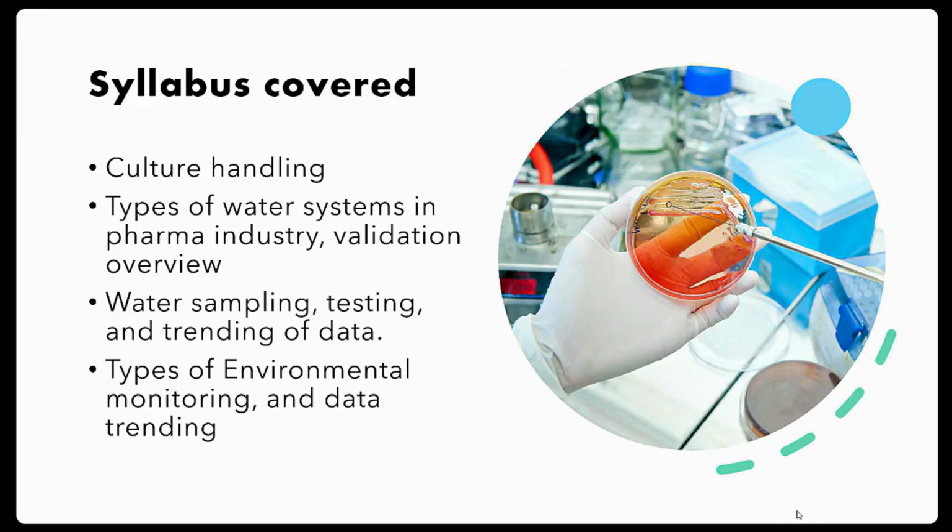And whenever a new water system is constructed, we have to validate the system. What are all the steps involved in the validation? We will discuss in this chapter.